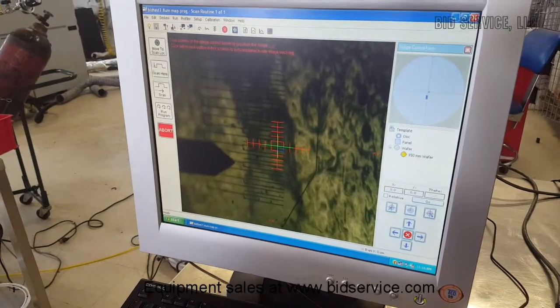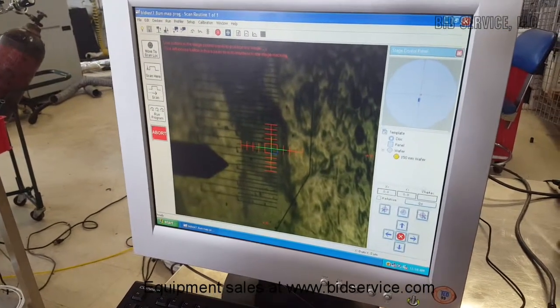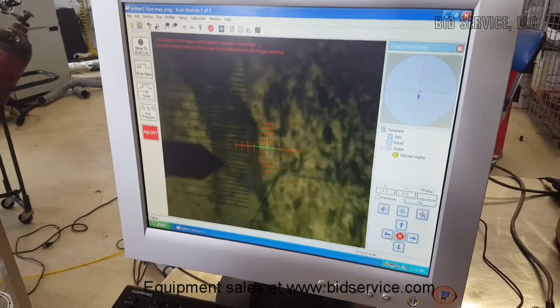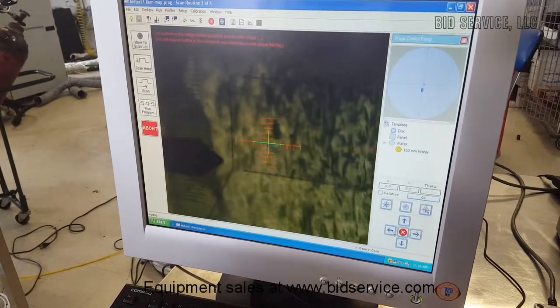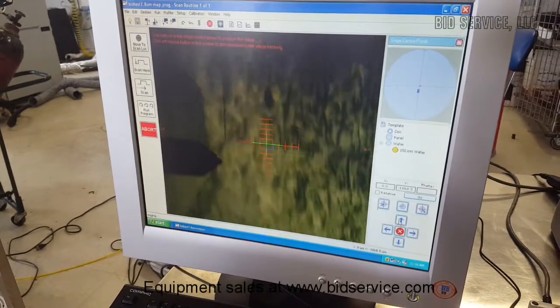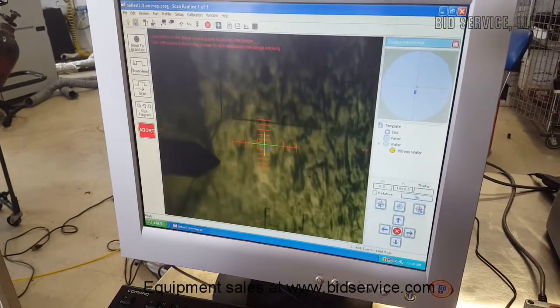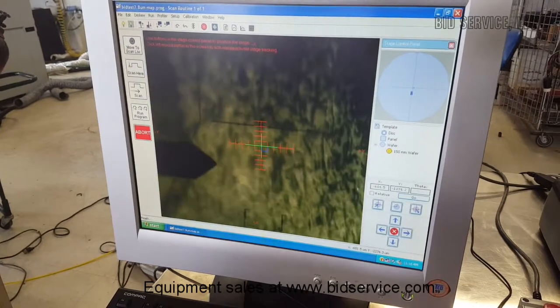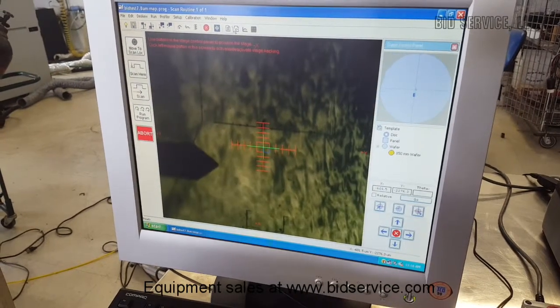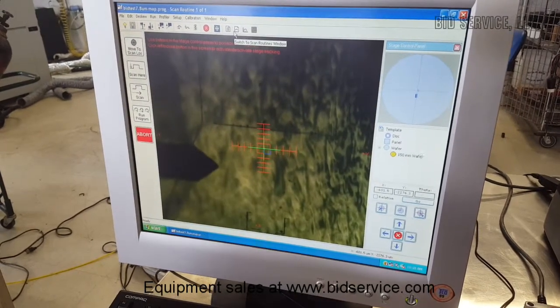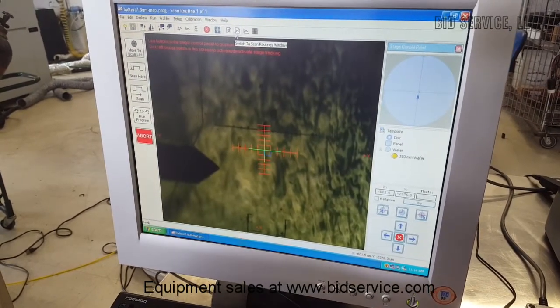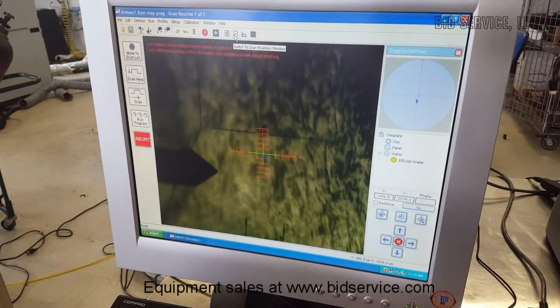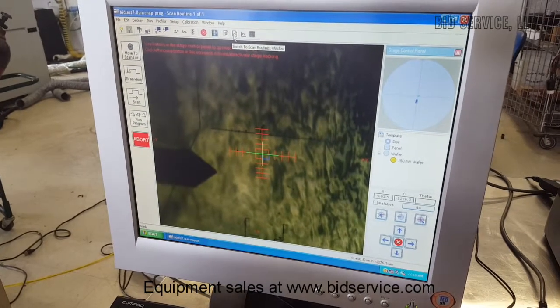Now this is the image on the screen. You can use these buttons to position the stylus wherever you want to measure. This icon here is used for setting up scan routines.